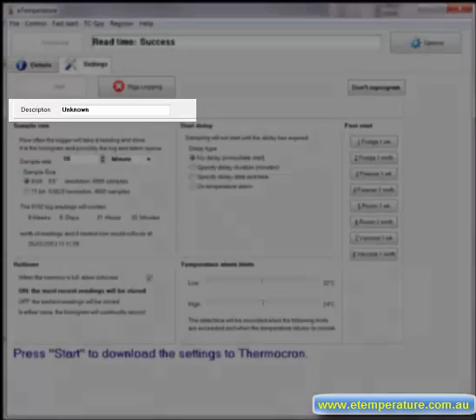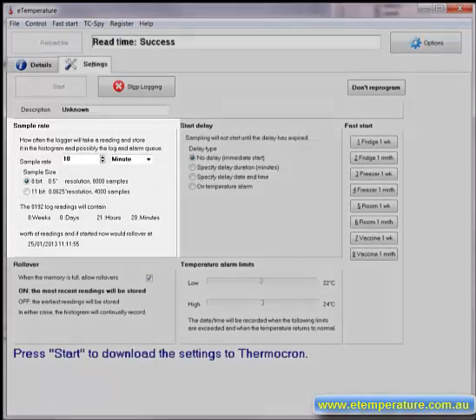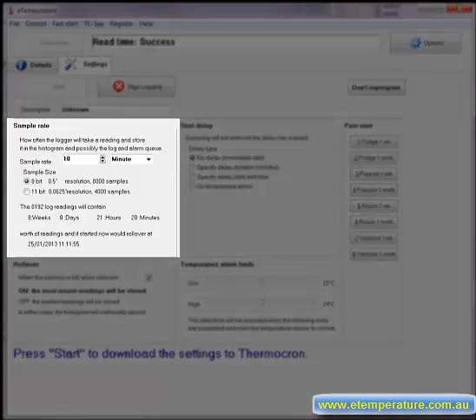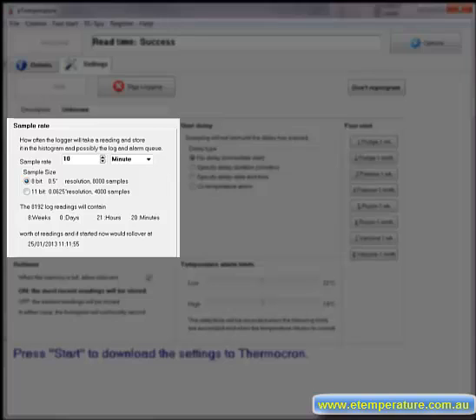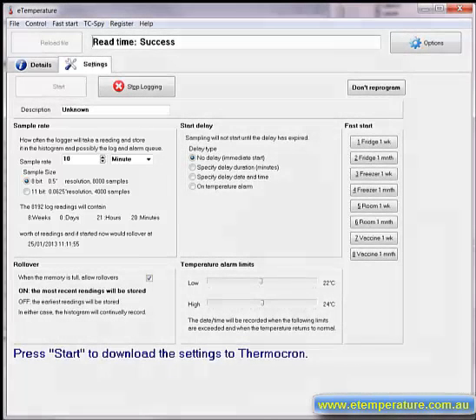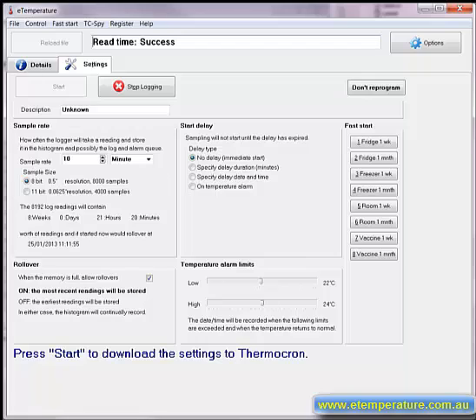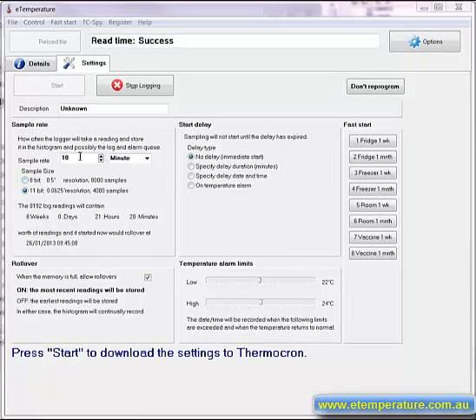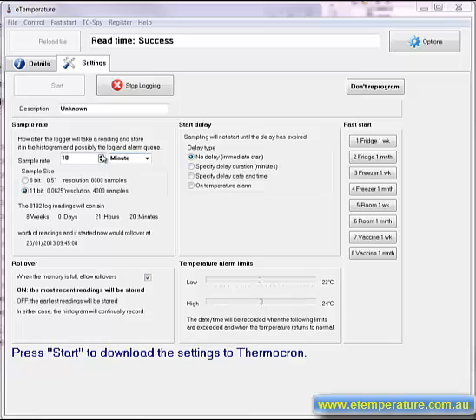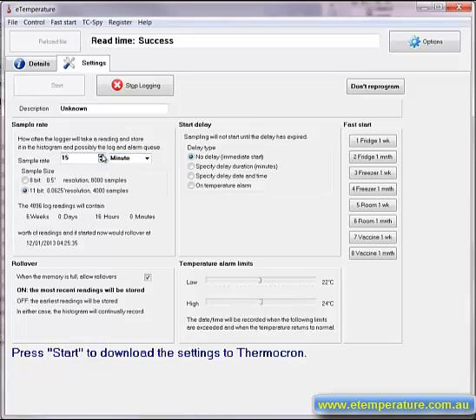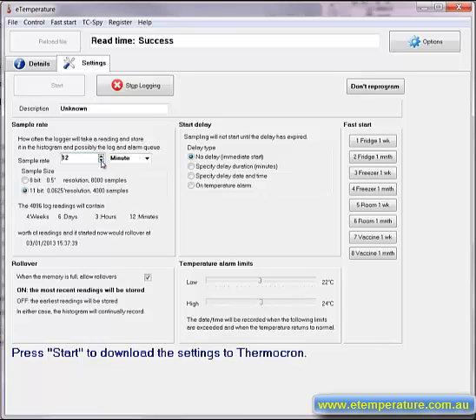The next thing to set up is the sample rate. This is how often the temperature logger will wake up and store a temperature reading. There is a compromise between being too fast and using up the memory too quickly, or being too slow and missing critical information. As you change the sample rate you will see the information about when it will run out of memory change. If you download the results before this date you will not lose any results.